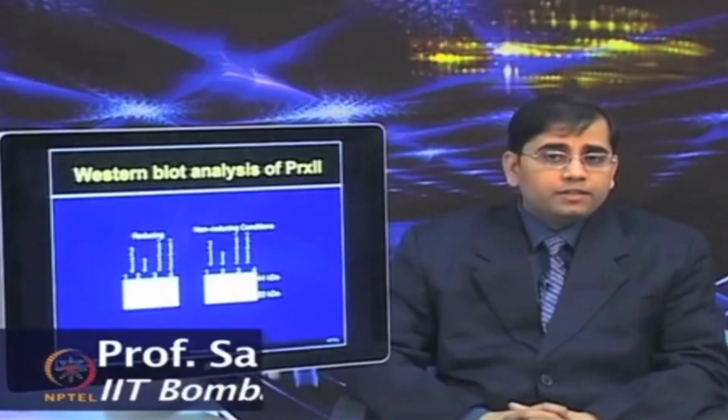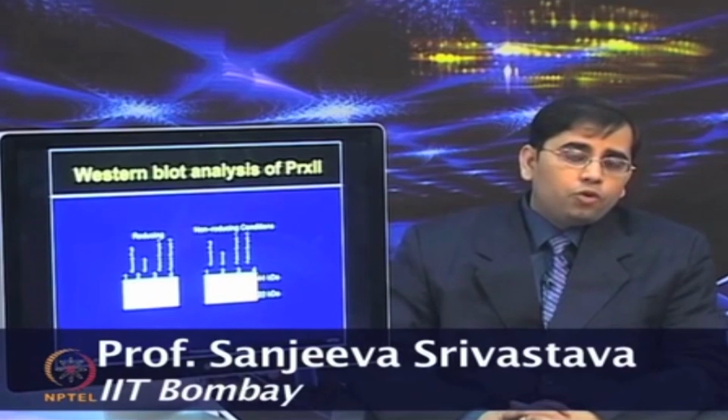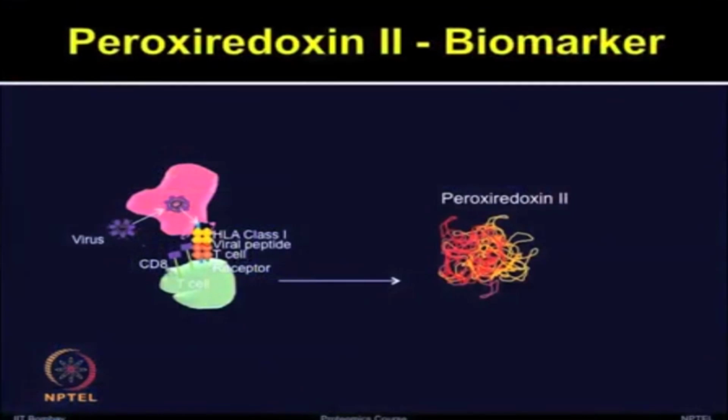These results demonstrated that 4 out of 20 SARS probable cases and 4 of the 20 SARS suspected cases showed higher upregulation of plasma peroxiredoxin 2. So, among the various proteins identified from this study, peroxiredoxin 2 appeared quite interesting, also because it was validated by independent techniques.